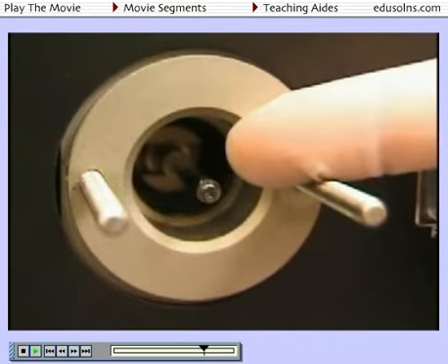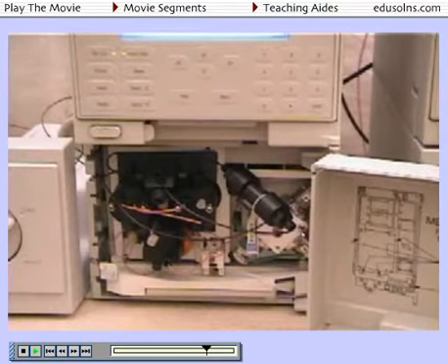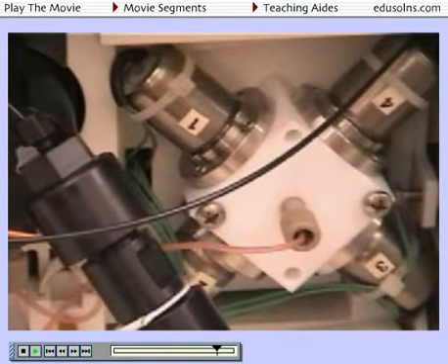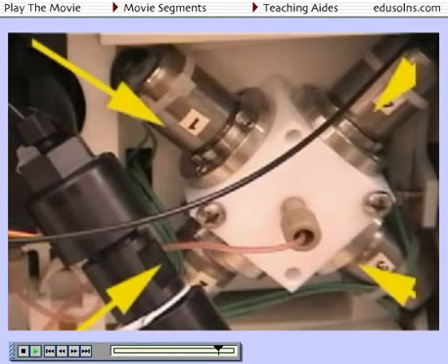In the past, HPLC systems had a separate pump for each solvent reservoir. This design significantly added to the cost of the systems, especially if the composition of the mobile phase was changed during an analysis, such as in a gradient elution. Many modern HPLC systems use a proportioning valve to adjust the mixture when more than one mobile phase is used. The proportioning valve in this system is located on the right side of the screen. It can adjust the composition of the mobile phase for up to 4 different reservoirs.